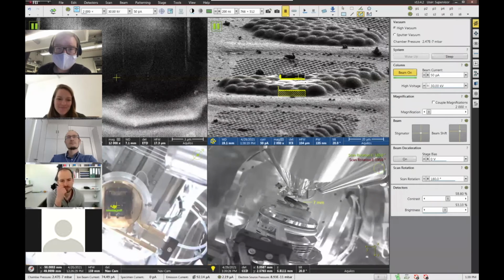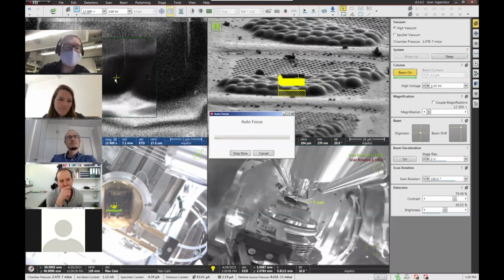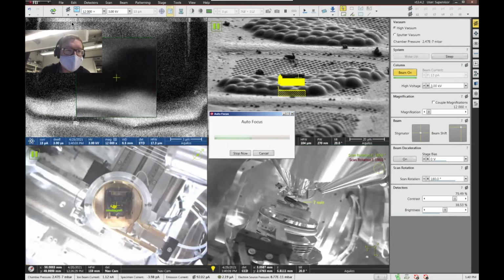And then it's going to create all the patterns that it's going to need. Then we're going to see that the autofocus fails, I think, but maybe we're lucky today, because there's just not much contrast that you can put on in a short time to focus, and the charging actually kills you because your contrast even changes over time when you take the focus images. So if someone has an idea, I'll be happy to hear and implement, because at the moment I couldn't find anyone to have suggestions, and I've been working on that for quite some time. Yeah, so let's see how the autofocusing does.